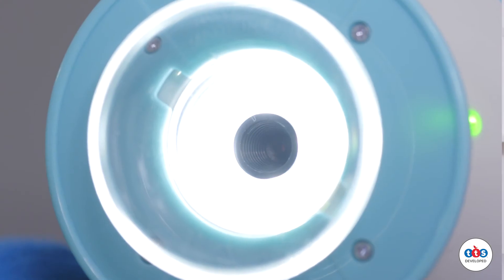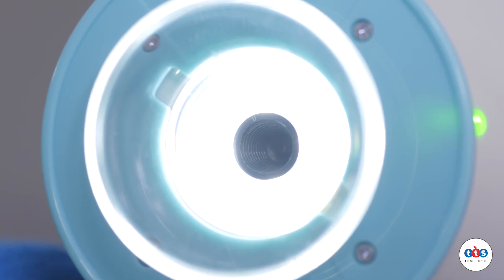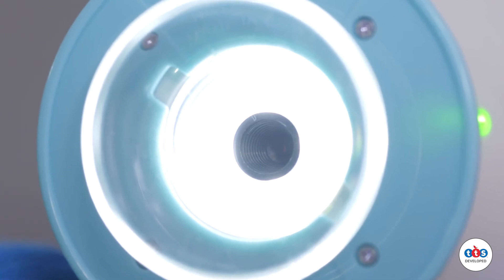Like all products at TTS, the EasyScope visual has undergone vigorous testing to ensure it can withstand life in a primary classroom. It will make a fantastic addition to any science classroom.